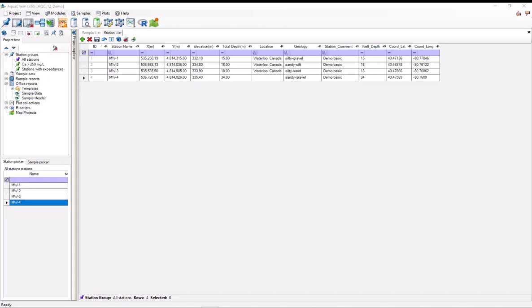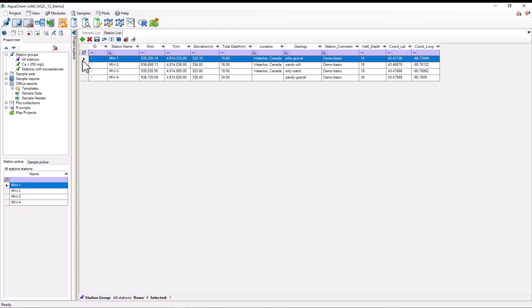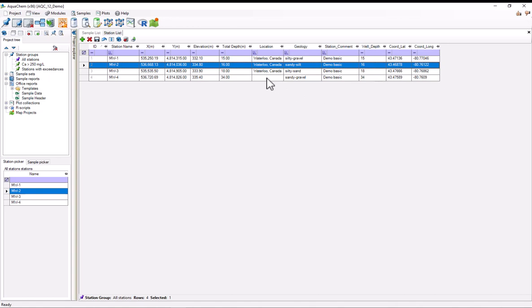In AquaChem, the database structure is much more structured than something like Excel. In AquaChem, you've got discrete tables. For example, the station list is a table. On each table, you've got individual records. So each one of these rows is a record. And for each one of these records, they've all got the same number of fields. That's these columns. Some of these fields have rules, some of them don't.